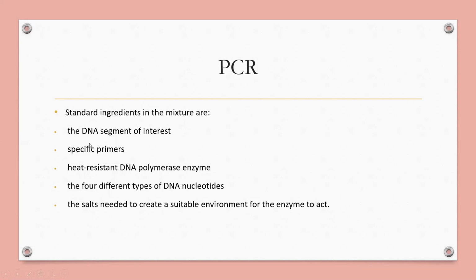Primers play a significant role in determining PCR. Primers means 17 to 30 nucleotides, without secondary structure and without complementarity among themselves are ideal. Complementary primers can hybridize to form primer dimers and get amplified in PCR. This prevents the multiplication of target DNA.